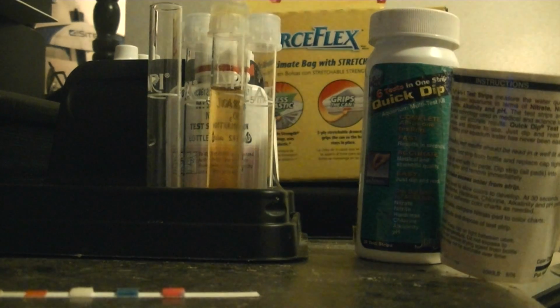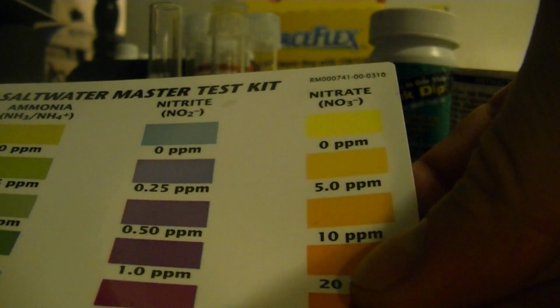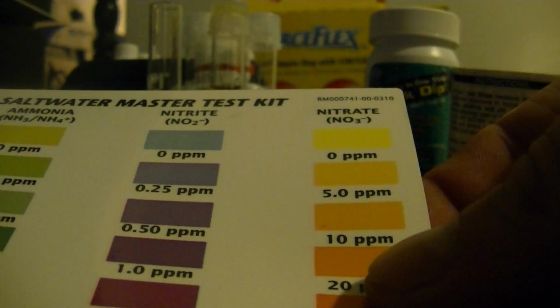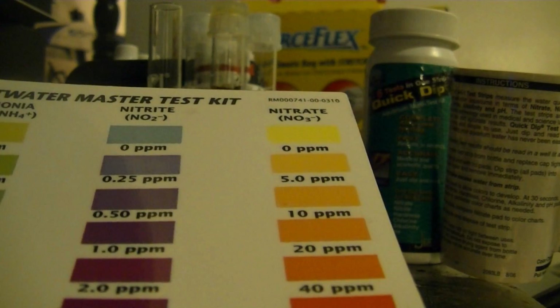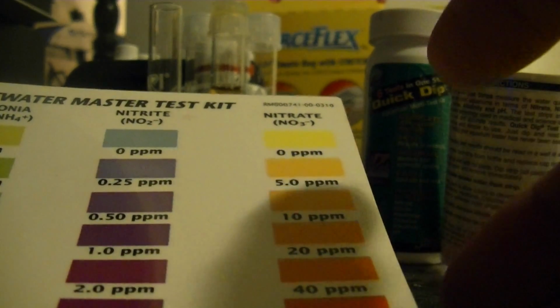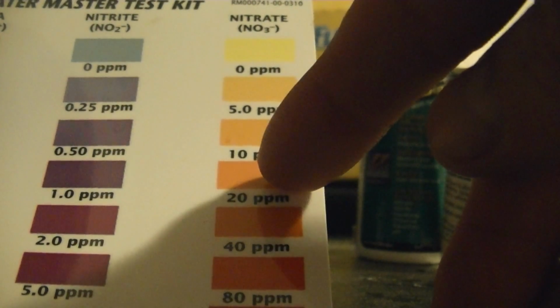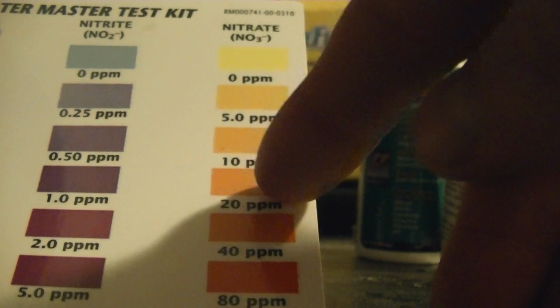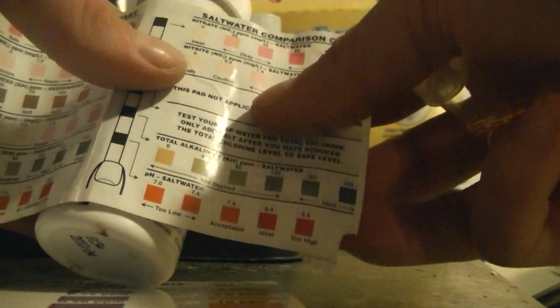And this came with a booklet thing. So my tank's mostly a fish only tank. I do have an anemone in there. And for a fish only tank, you really want to stay 20 parts per million or less. So how this works is 20 parts per million is under the color that it is. So this is 20 parts per million color. So the directions say to wait 5 minutes, but I believe my test strip, if I'm not mistaken, said we had 40 parts per million.